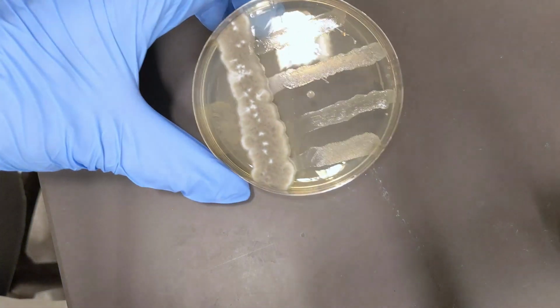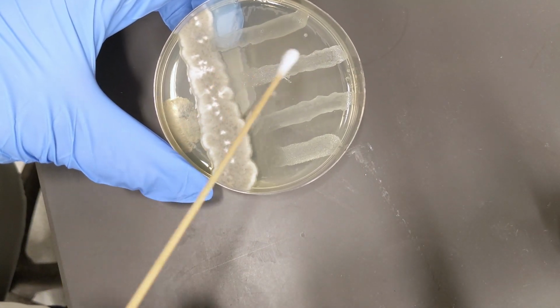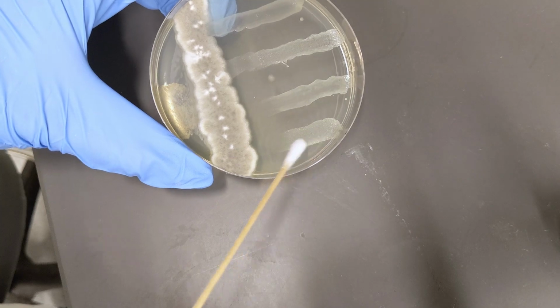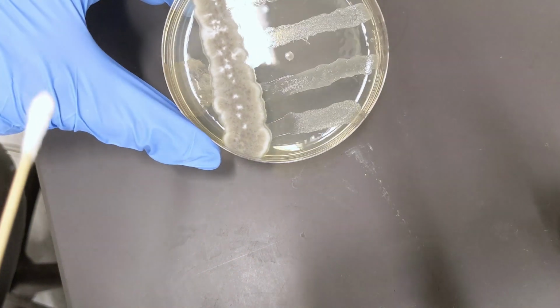Here the top one is E. coli. Second one is S. aureus ATCC 25923. Third one is S. aureus RN4220, and fourth one is S. aureus A325.